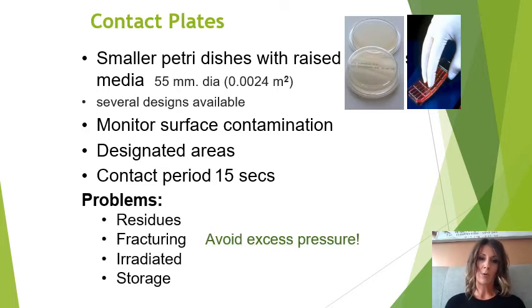The problem with contact plates is leaving a residue behind. If you forget to wipe that surface with an IMS spray and wipe, you could leave agar residue on the surface that you've just done a contact sample. That is detrimental because it then provides a lovely area for microorganisms to adhere and proliferate, because you've left some of that residue behind.